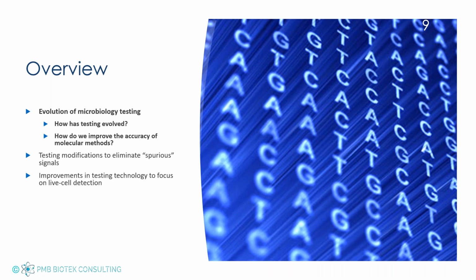Then we're going to talk about, what are these companies doing to essentially reduce invalid results when we're testing products. And a lot of this work has been started in the food industry and is now being transitioned into the cannabis industry. And there's some actual real world examples that I have from working with labs that have used certain techniques to eliminate these spurious signals.